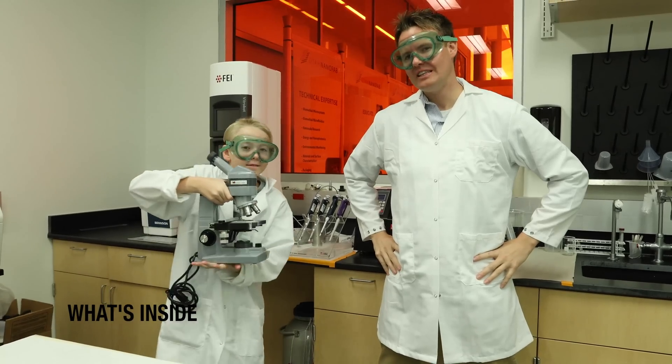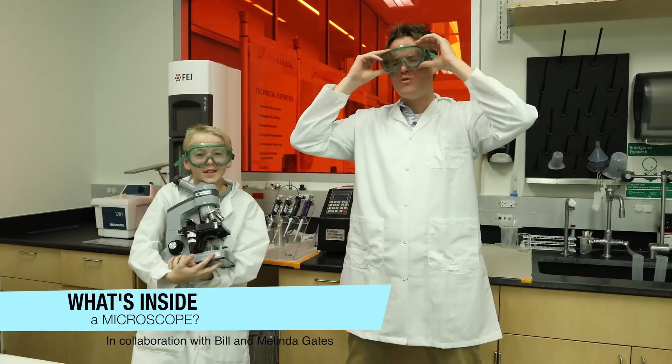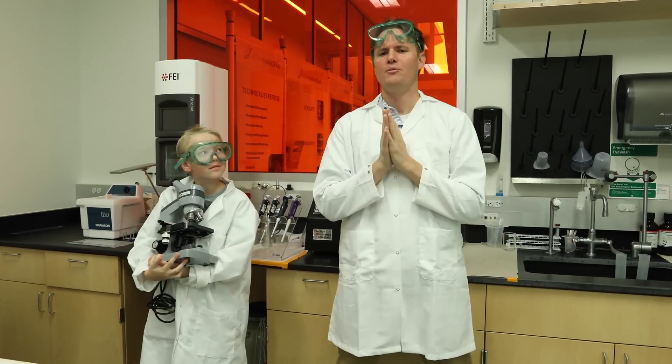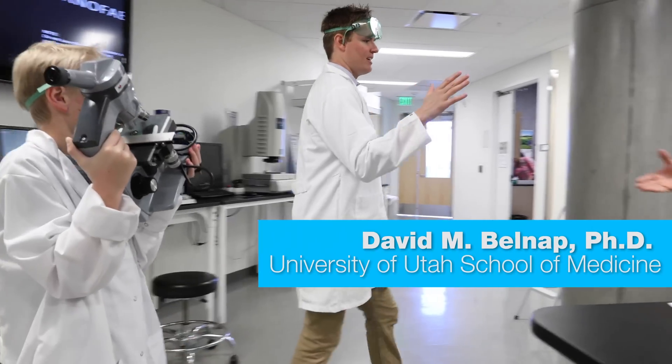Microscope down! We are at the electron microscope lab at University of Utah. We figured if we're going to cut open a microscope, we need to meet with some people that actually understand a microscope and know how it works. I'm David. I'm Dan.